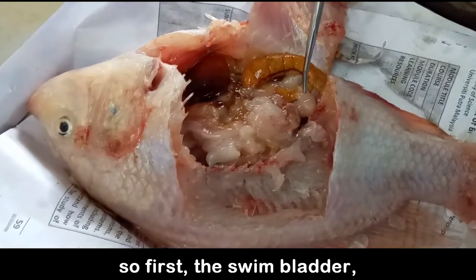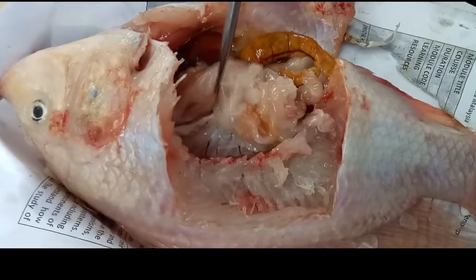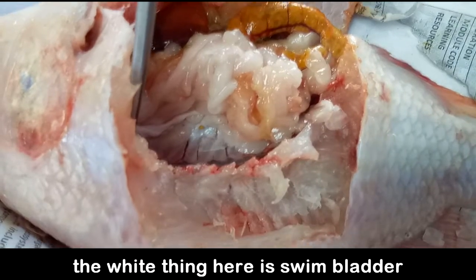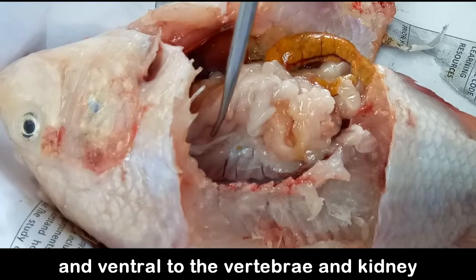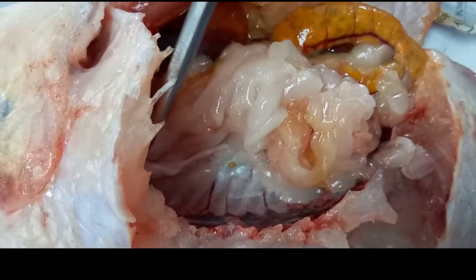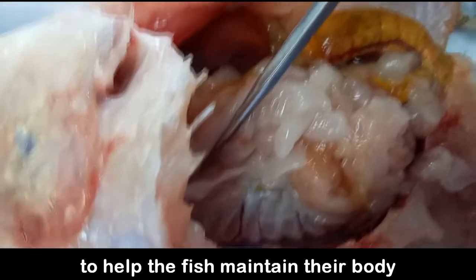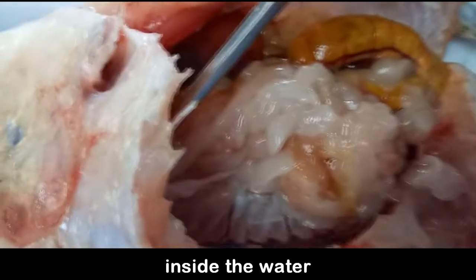So first, the swim bladder. Yeah, the white thing here is the swim bladder. Usually it is located dorsal to the viscera and ventral to the vertebrae and kidneys. So this is the swim bladder. The function of the swim bladder is to help the fish maintain their body to float in the water, so they do not drown inside the water.